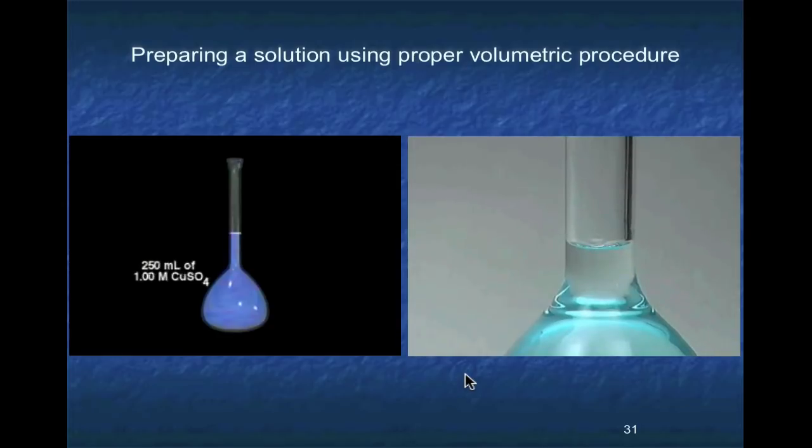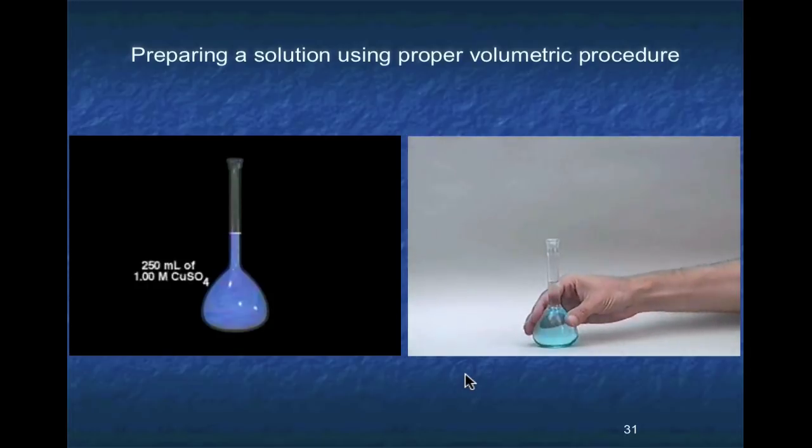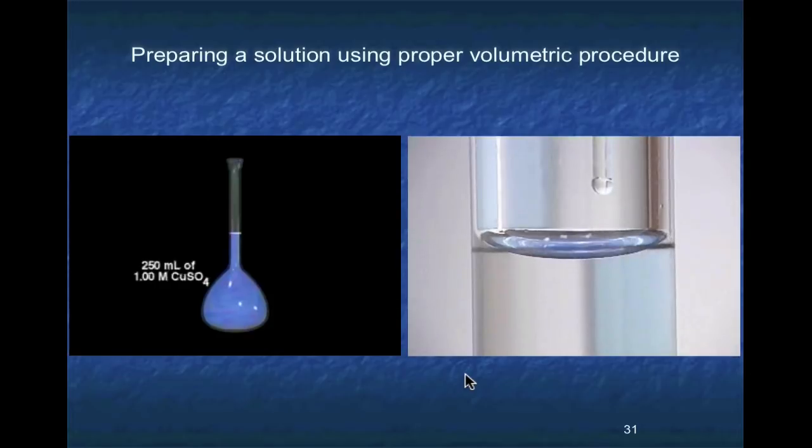Take this last opportunity to mix the solution well before diluting it to the mark. When the solution level is near the mark, check that the temperature of the solution is near room temperature. If it is not, wait for it to reach room temperature. Use an eyedropper to bring the meniscus to the mark.